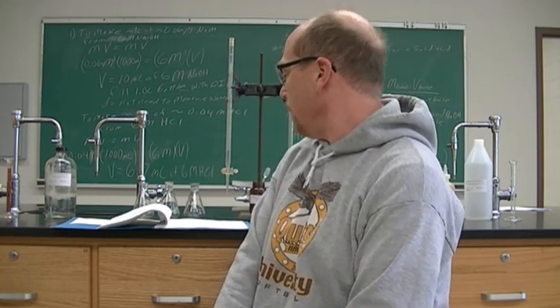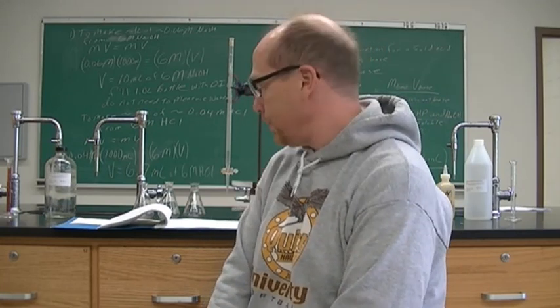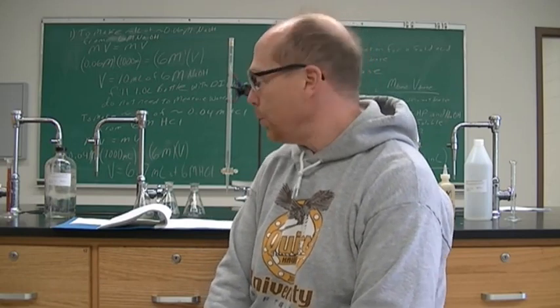So first thing we're going to do is prepare our acid and base solutions. And in number 1, if you are following along, which you should be, experiment 12, it says to prepare approximately 1 liter of approximately 0.06 molar NaOH. All right, it also says to make 0.04 molar HCl, approximately, in approximately 1 liter. So the approximately's make this very simple.